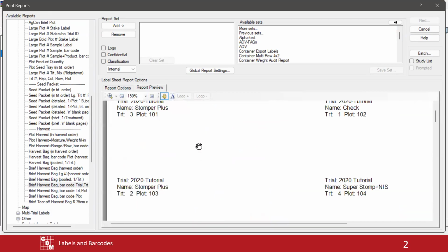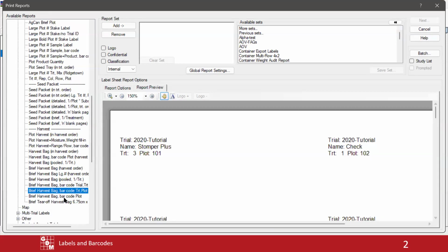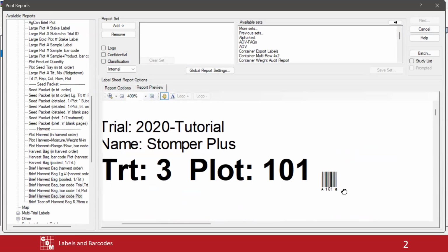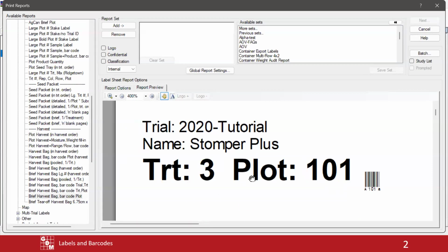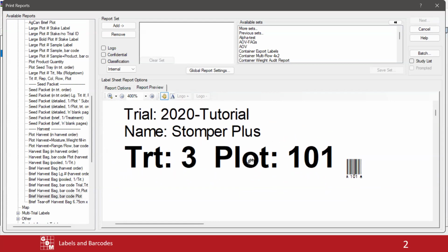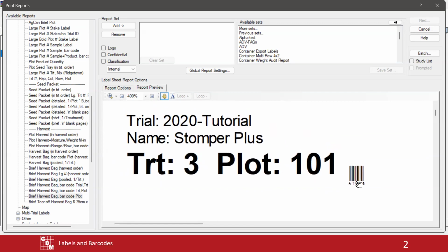Of course, now we've lost our barcode somehow. We'll just stick with one of these, it's printing something at least. We've labeled this plot number. We put everything that we've harvested into this bag that matches here. We could then use a software. We could actually even use ARM if we wanted to.